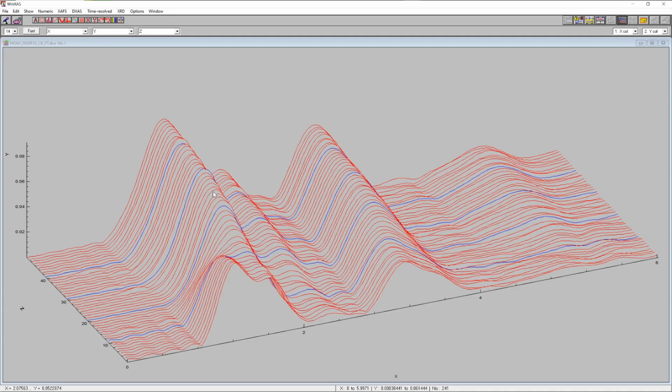And so now the next step, the last step that we want to do actually, is analyze the EXAFS, do some EXAFS refinement actually, and try to extract some structural parameters that we then can display as a function of time. In this case, since, as I mentioned before, this is an isothermal reduction experiment, we can extract structural parameters as a function of time when we analyze those XAFS spectra, and this is what we want to do in the next step.